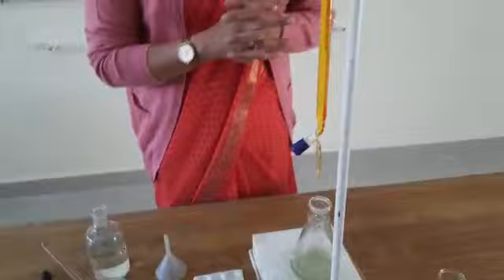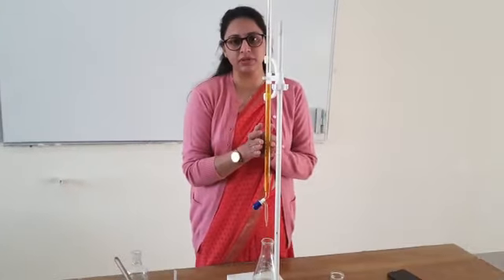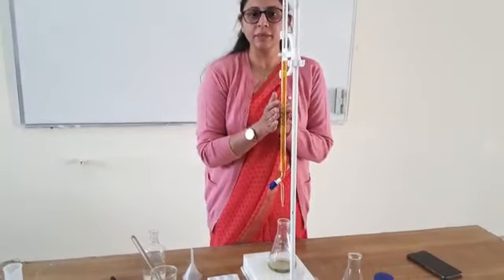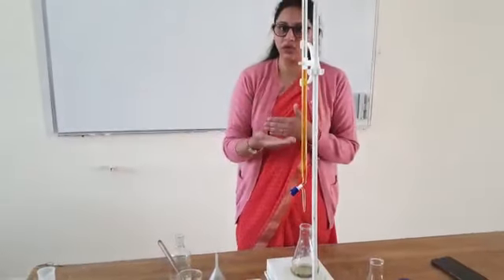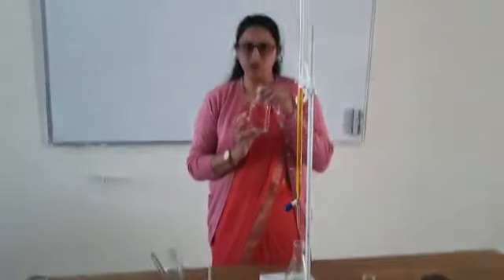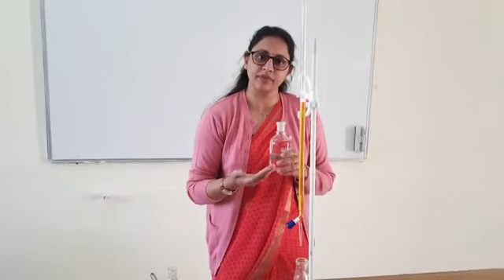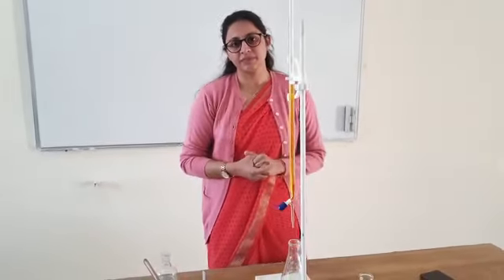By doing so, we have standardized the potassium dichromate — this is the first step of this titration. Now we will calculate the strength of the potassium dichromate. For the second titration, this will be the standard solution and we will take the unknown ferrous ammonium sulfate and repeat the same practical. This is how the practical takes place. Thank you.